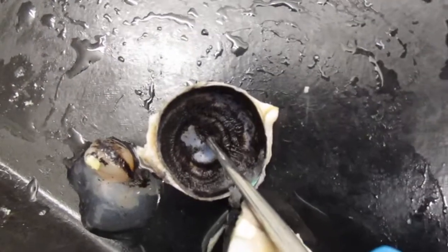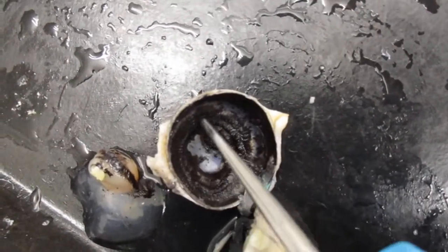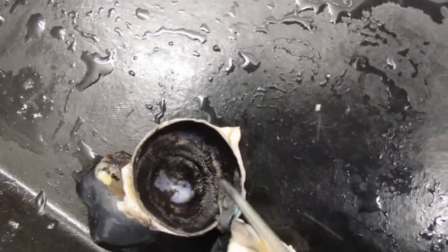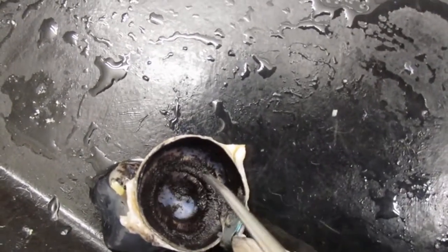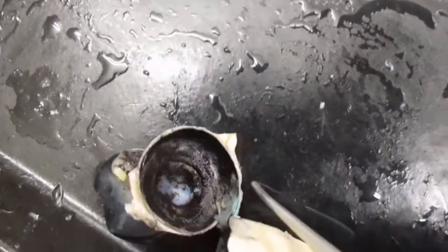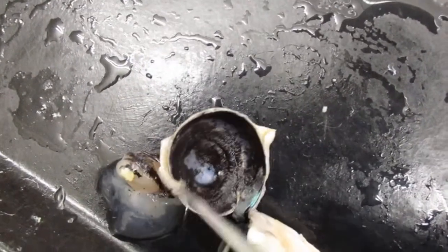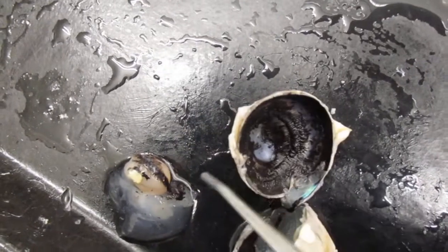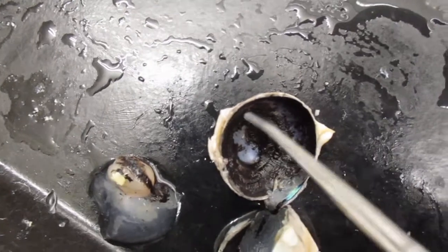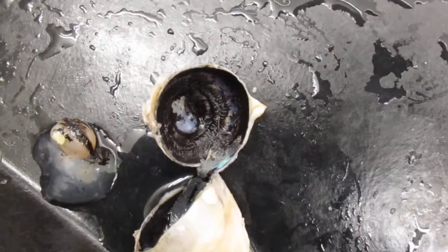And then this right here, around that black stuff, would be the iris. The iris is going to control the size of your pupil, through parasympathetic and sympathetic innervation.